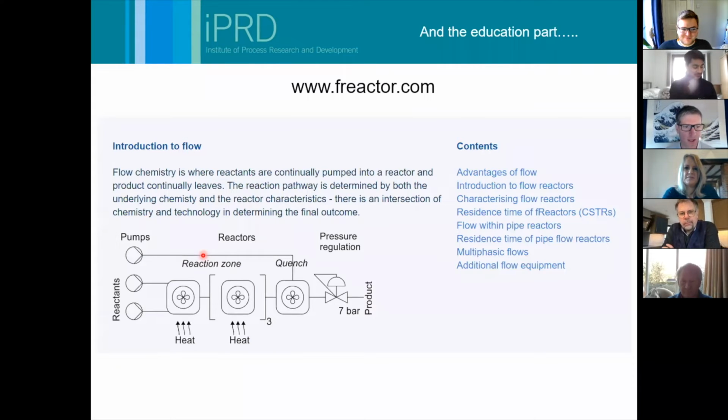Last thing I just want to say is, myself and John are really passionate about getting people to use flow chemistry. It's one of the pillars of green chemistry, and we think it's really important. We have developed some educational content as well, because we realize people haven't necessarily done flow chemistry as undergraduates, as chemists. We're trying to change that within Leeds. Our undergraduates, when our labs are opening, do flow chemistry with John. But we've put some information on these web pages so you can find out about flow.